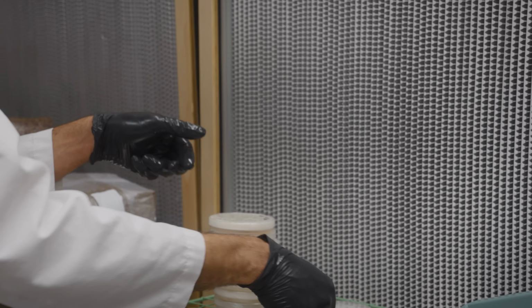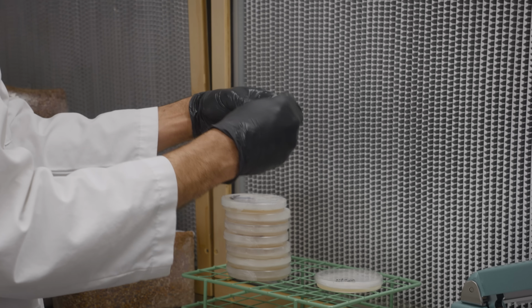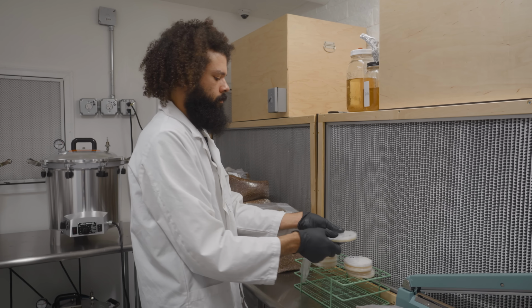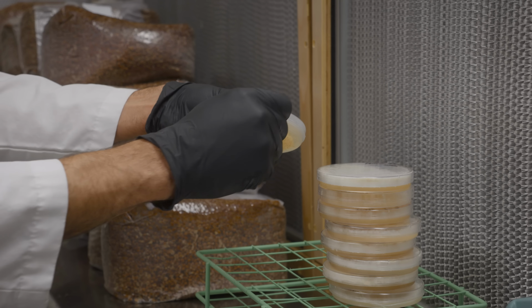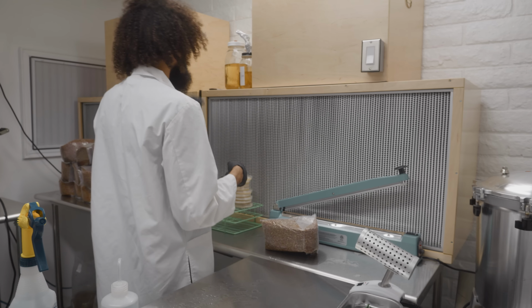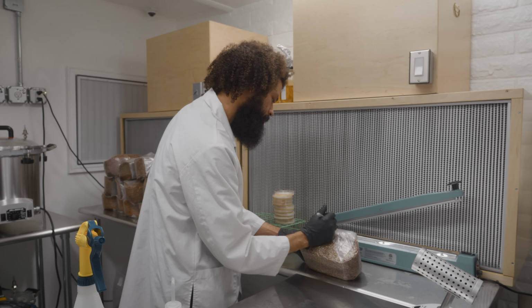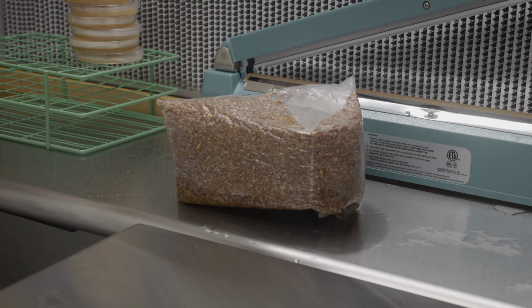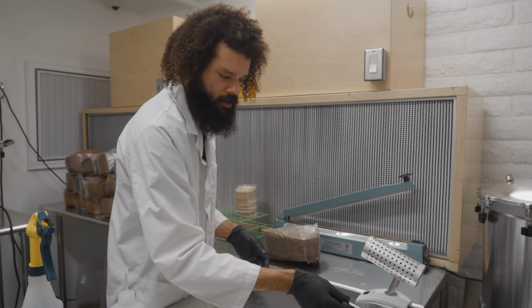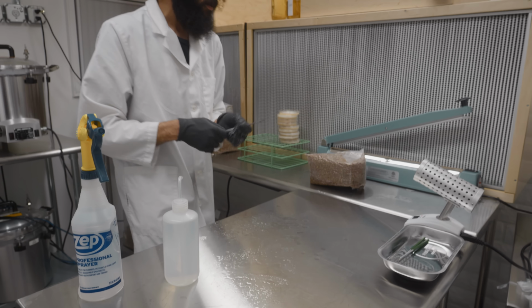Go ahead and unwrap the petri dishes of the parafilm and set them back there. Just toss that aside. I'll label the Generation 1 bags with the Sharpie that I have on hand. There we go, that way we don't get confused or have any spawn mixed up. I have my scalpel nearby, and something to sterilize my tools. I really like this magnetic tray, so everything sticks to it. It sticks to the table and works really well for keeping all the tools safe.